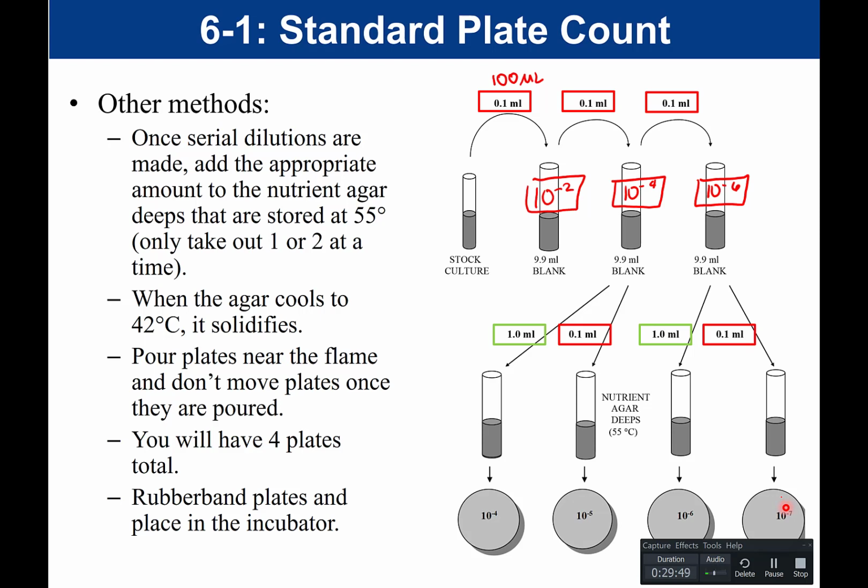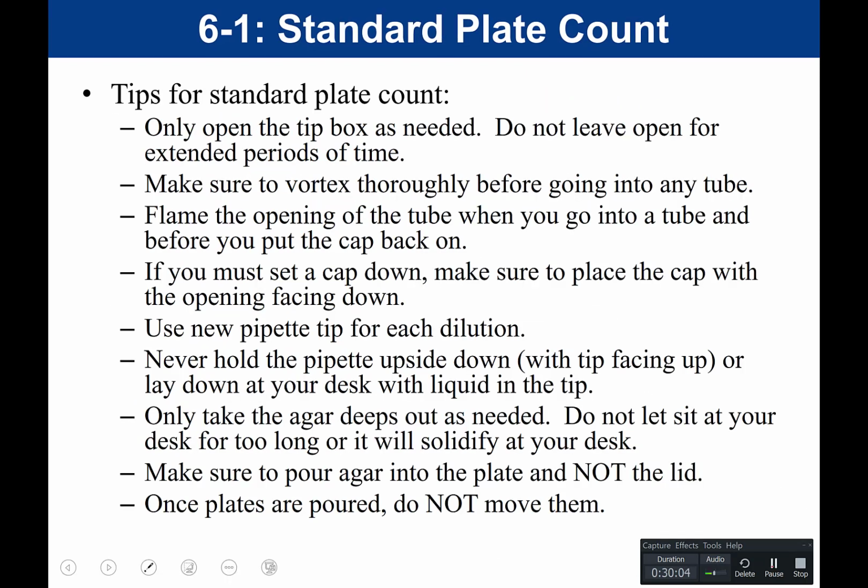There will be a video demonstrating how this is done so that you can see it in action. It makes it a lot easier to see when the experiment is done. But this part is just simply walking you through the steps. So some tips for when we do our standard plate count. Number 1, only open the tip box as needed.